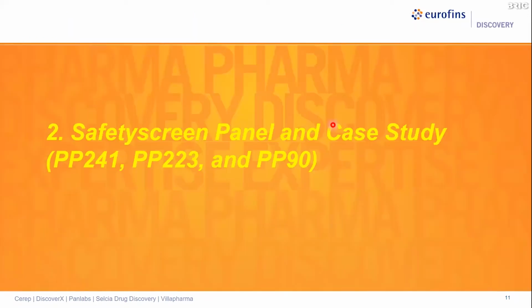Okay, next I'm going to show you a case study of how we use our safety screen panel with an already marketed drug, how we find the result, and how we interpret it against the already known secondary side effects.